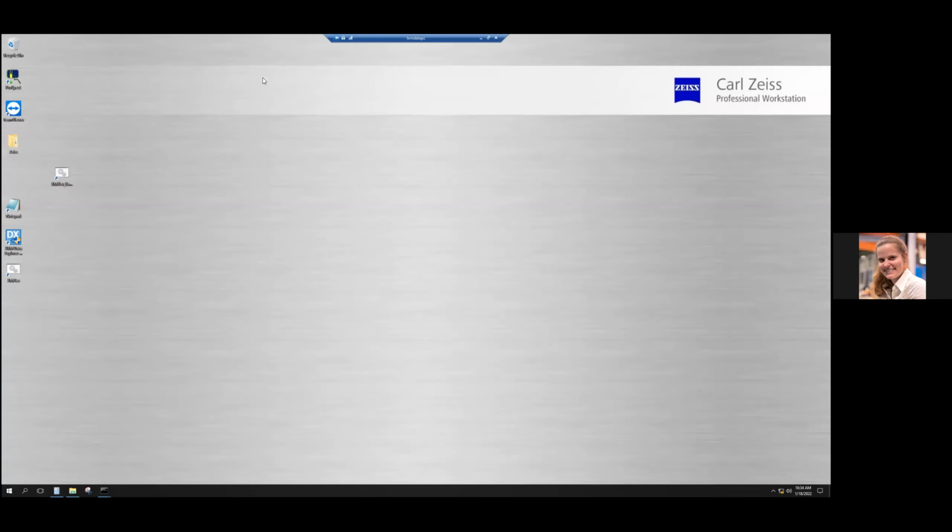Okay, so if you want to open up the microscope software, it is XM Dashboard that's right here. If you need XM Flex, it is the one right underneath it. I'm not sure what this is, so we're going to ignore that. That does not look like it's the proper XM Flex. So we'll open up the Data Explorer.